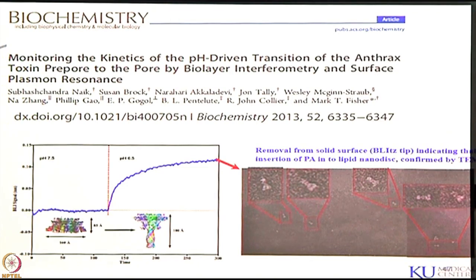Because when it comes to the SPR, when you elute the complex mixture and collect it, your sample is more diluted, so you have to concentrate it and then perform the further studies. You can enrich in the dip in the well itself here.